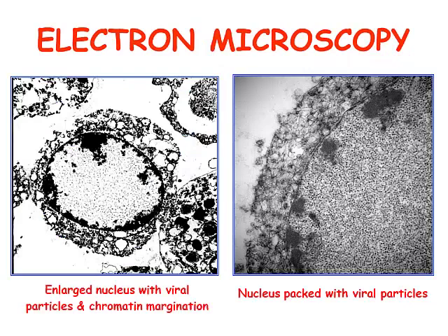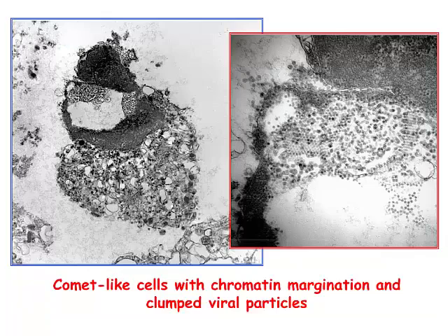And you see here how decoy cells appear in the urine when investigated by electron microscopy. They are cells whose nucleus contains a variable amount of viral particles, with coarse chromatin granules along the border of the nuclear membrane.